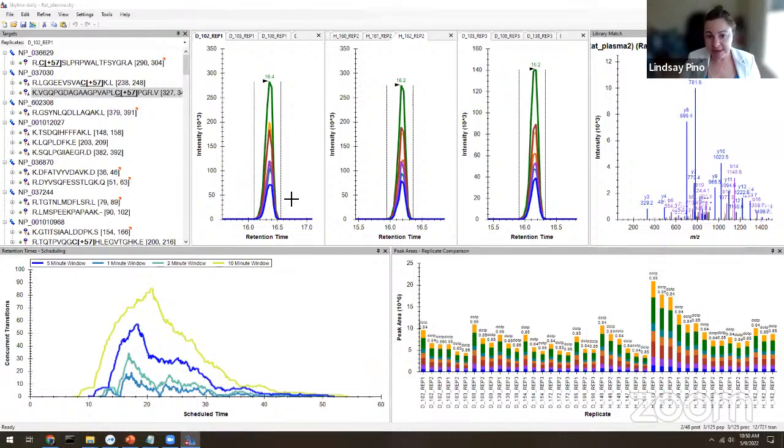For single cell proteomic data, I don't have any experience with single cell proteomics or doing DIA with that. For the spectral library, all I can really advise is that the spectral library should be as representative of your real samples as possible, because of the way fragmentation and matrix effects act together with retention time. If your real samples are nanogram levels of peptide, I would make my spectral library with nanogram levels of peptide.